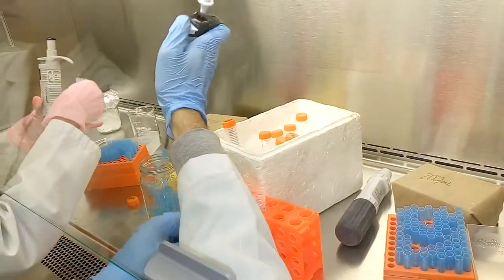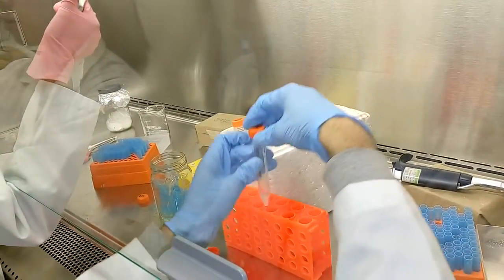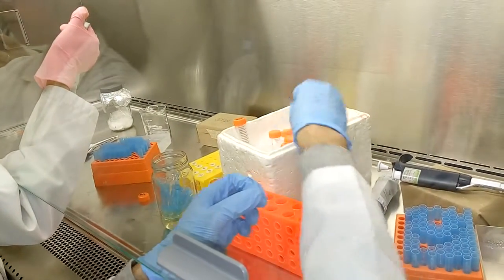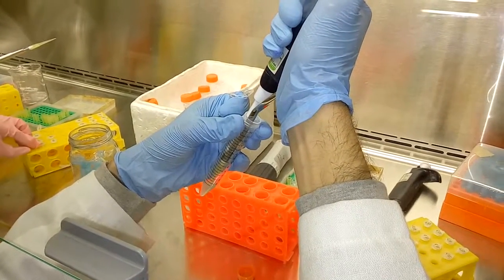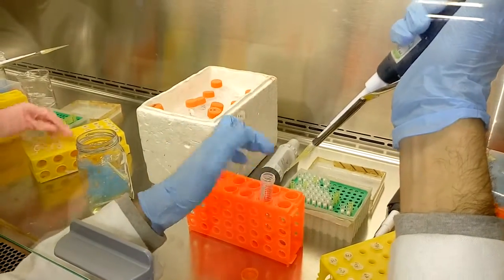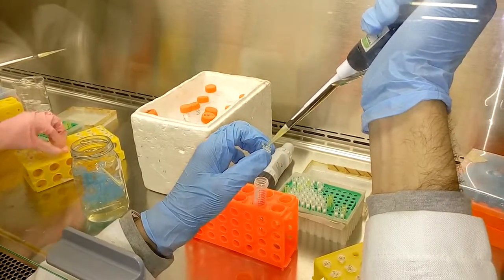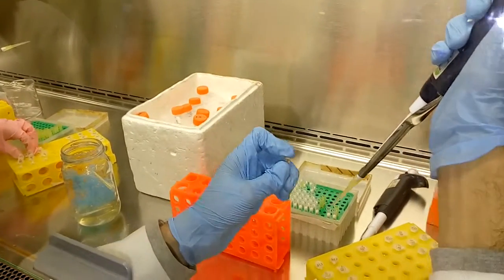The transformation efficiency can change according to the state of the plasmid inserted in the cells. For example, if it is supercoiled, the cells have no big trouble inserting the plasmid in its genome because it is smaller and easier to introduce through the membrane than if it is relaxed or linear. In these states, the molecule is bigger and harder to introduce.